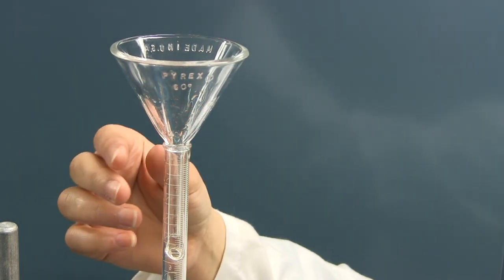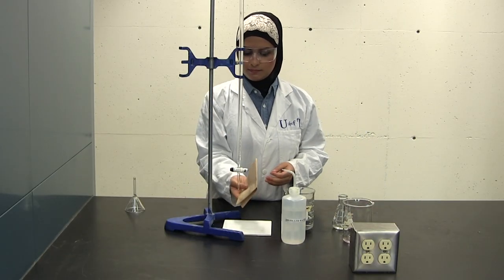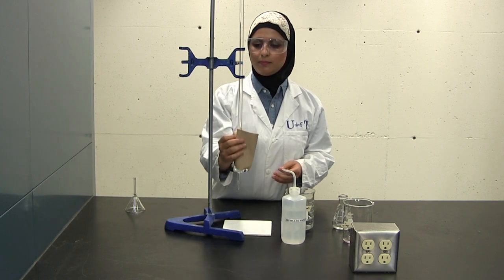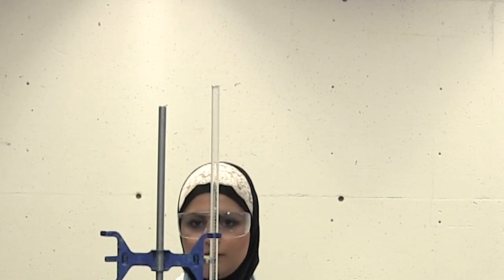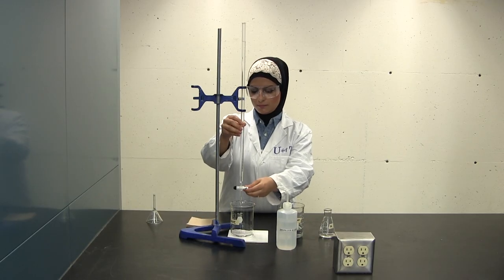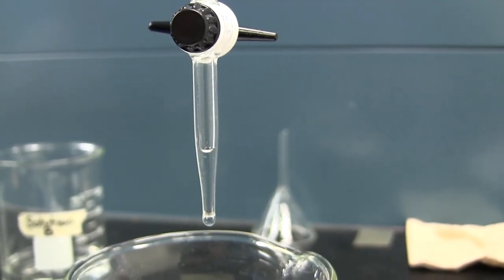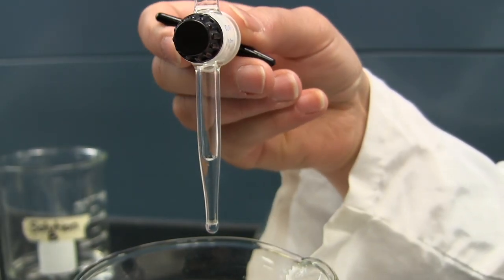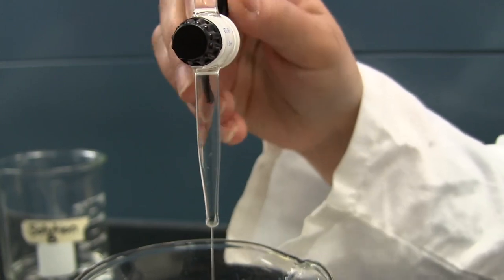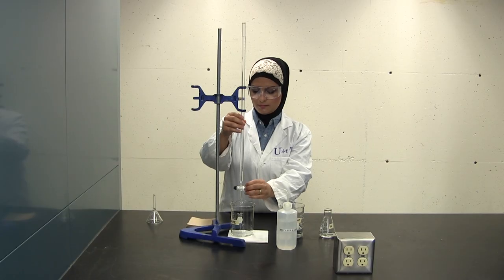If any solution gets on the outside of the burette, be sure to wipe it off. Once the burette has been filled, remove the funnel. It is important that you remove the funnel before taking any readings, or else you may drip additional solution into your burette which may lead to inaccurate readings. Make sure that there are no air bubbles in either the barrel or the tip of the burette, as this is an indication of a dirty burette. It is important that the tip is filled with solution, otherwise inaccurate volumes may be dispensed. If the burette is leaky, tighten the knob on the stopcock.